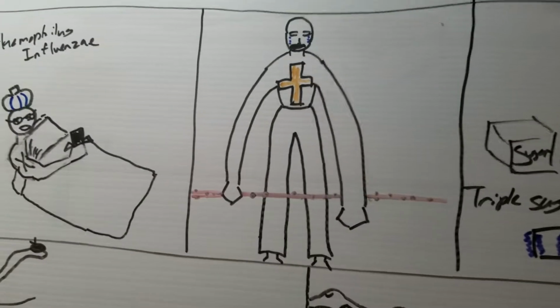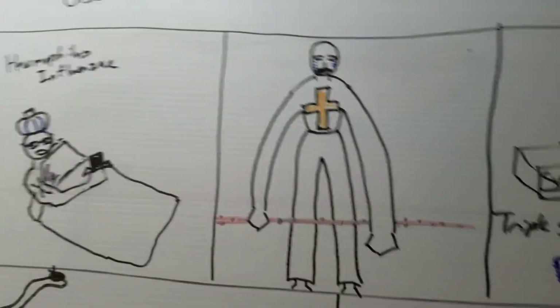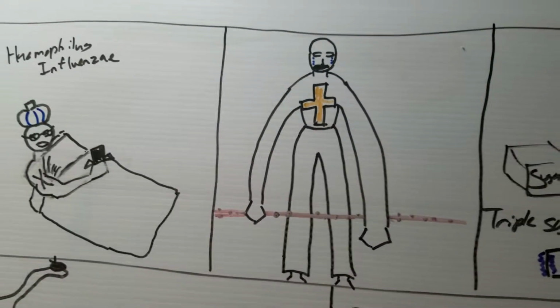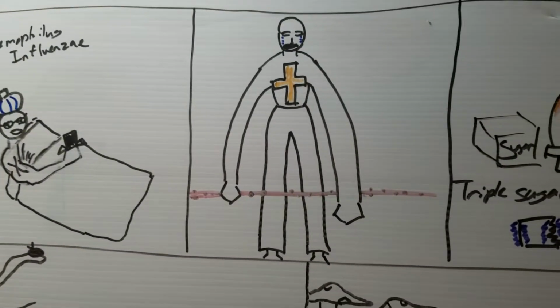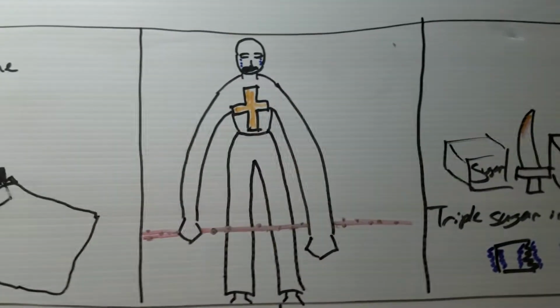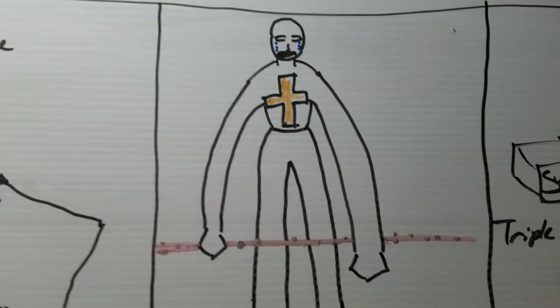So the staff is testing for Staphylococcus, right? You can see these little dots over here. Staphylococcus, and it's actually a negative test, right? So the thing is that you can see it's moving in a horizontal fashion like a negative sign. That's red. And then if it has a plus, you can see that cross on its chest.